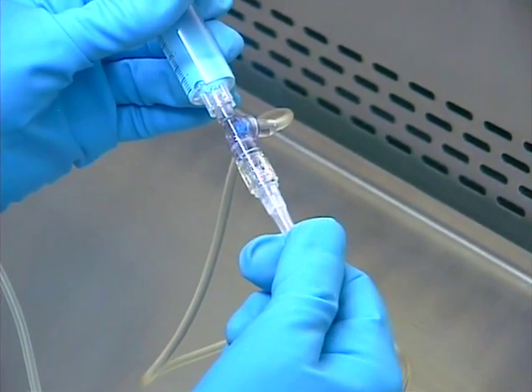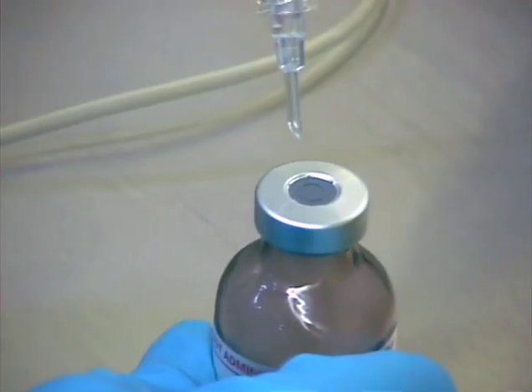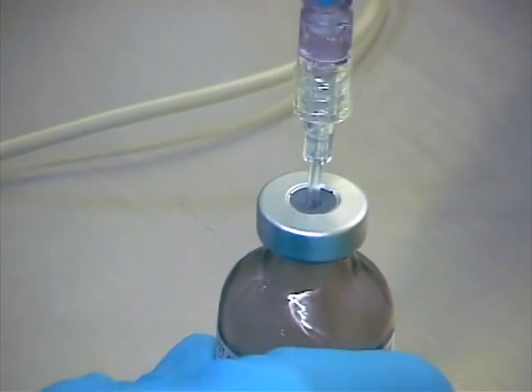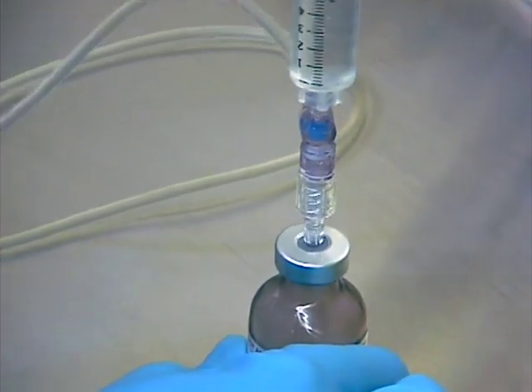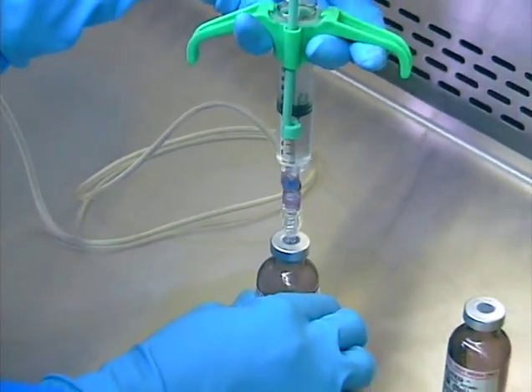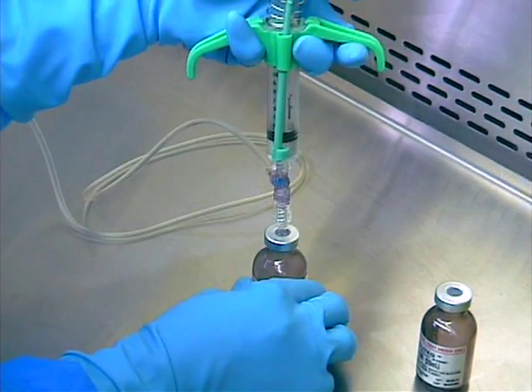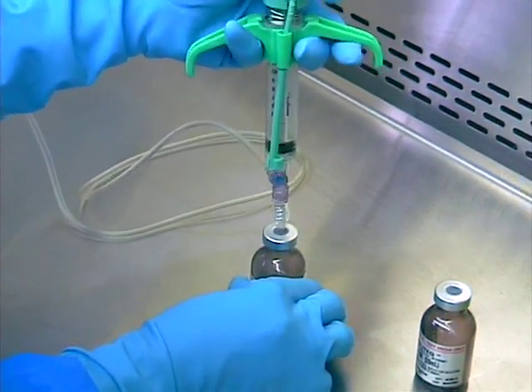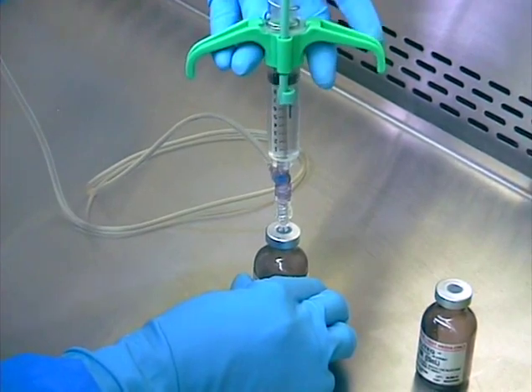When dispensing, always make sure the plunger is completely extended and the barrel of the syringe is full. Dispensing must be accomplished in a single positive injection, because allowing the plunger to retract will cause additional fluid to be added into the syringe, changing the final fluid volume delivered. Place an ID label on the reconstituted vial.